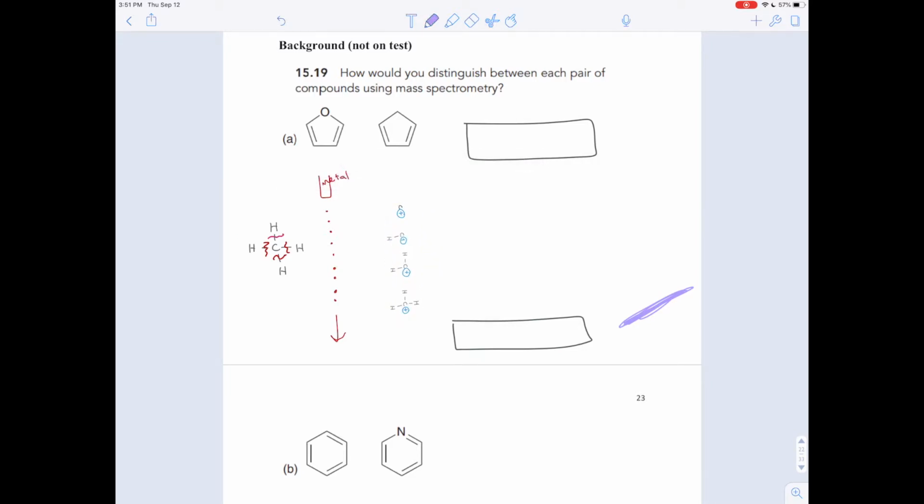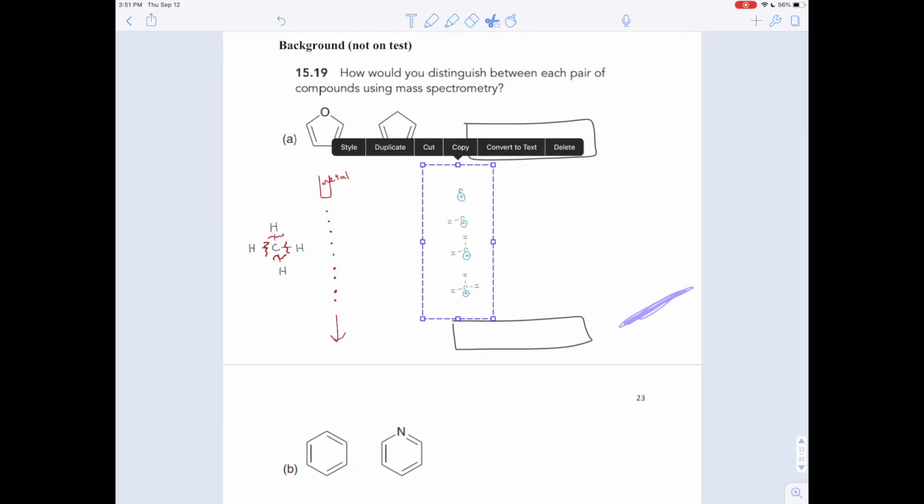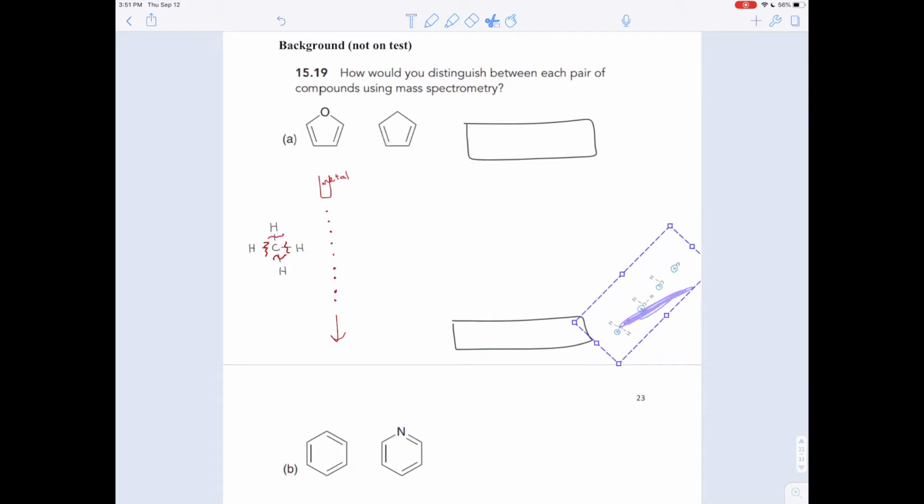Anything that has a zero charge on it, so we said these are just some examples of what could come out when you pass molecules through this stream of electrons, anything with no charge on it just goes through and hits a wall. It doesn't hit the detector. Anything with a negative charge would go through and then curve the other way. The magnets would interact the opposite way with it. But everything with a positive charge will go through, turn because of the magnets, and hit the detector.